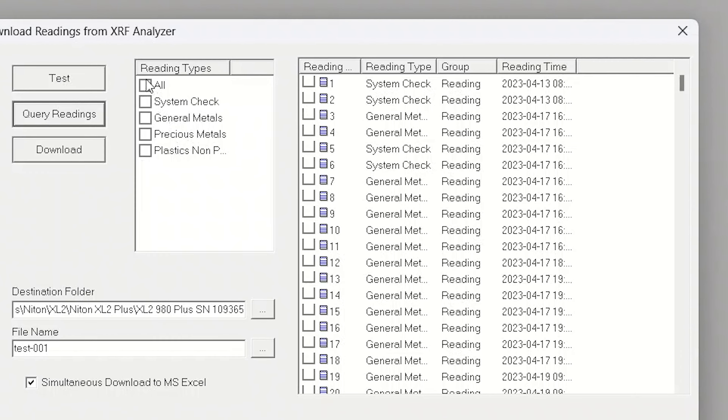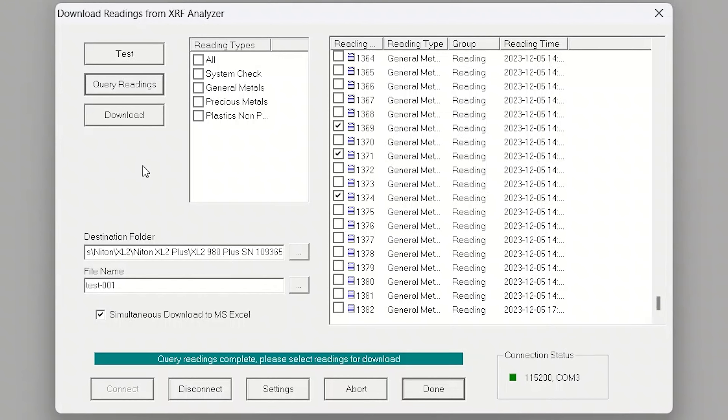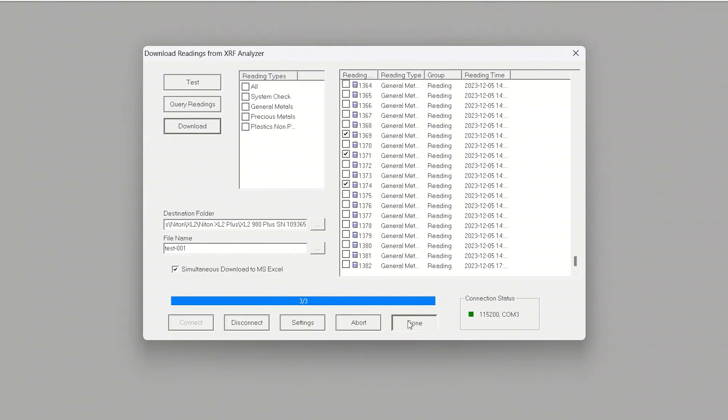All the readings here can be selected with these different checkboxes. I'm going to unselect them all right now and scroll down to the bottom. We're going to take the three readings we did today and download those. Always remember to pick a unique file name — it will default to 'XL2' plus the serial number of your instrument, but you need something that reminds you what that data actually means. I would always recommend enabling simultaneous download to Microsoft Excel using this checkbox at the bottom, which gives you the ability to open the file in Excel versus just saving it to the software package.